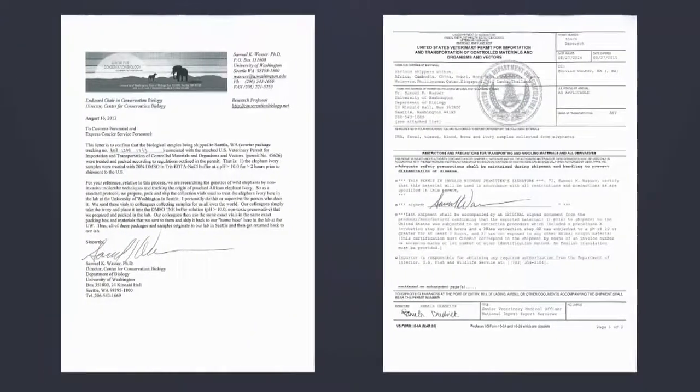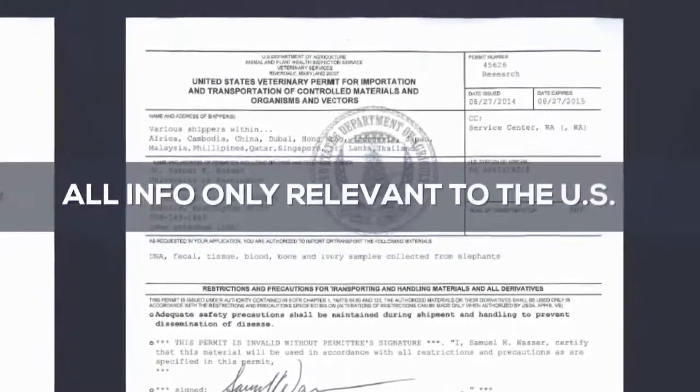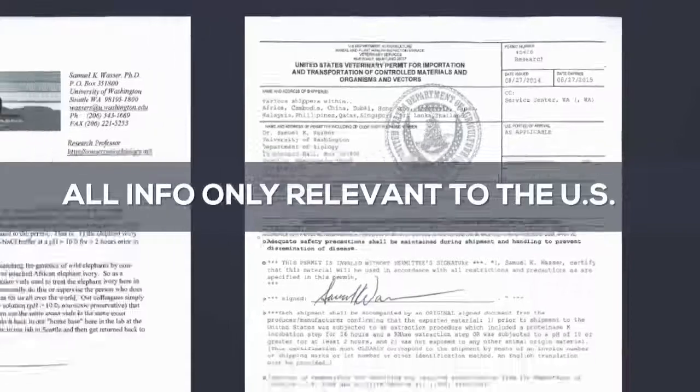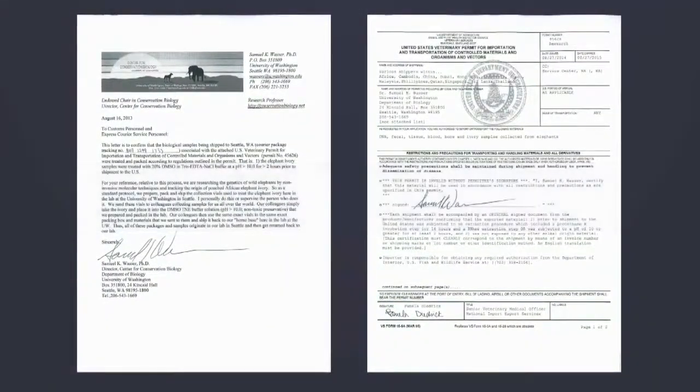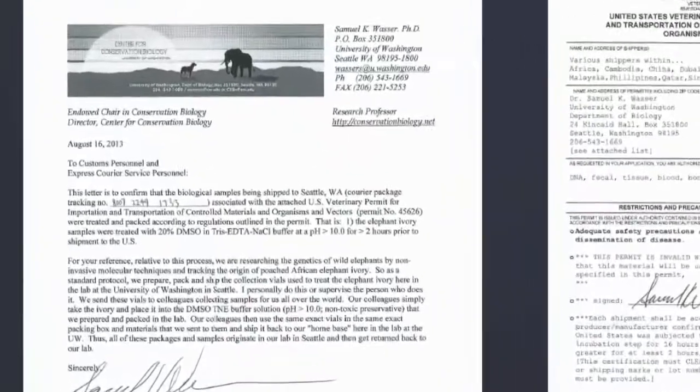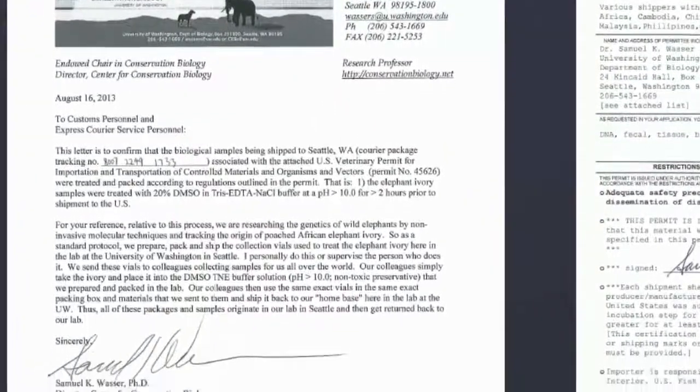An original signed USDA permit is required, together with a signed letter on the laboratory's letterhead, stating that the laboratory provided the decontaminating solution that the samples were submerged in. Write the courier tracking number on the blank line indicated in the letter.